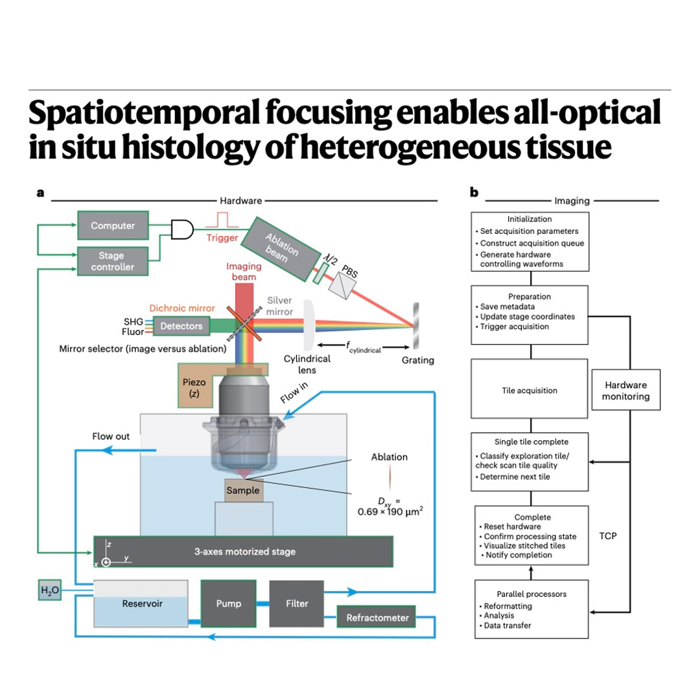Right. It's a really clever fusion of technologies. Okay, let's unpack the system itself first. What are we actually looking at? The papers describe it as having this dual identity. It's both a microscope and a precision cutting tool. That's really the heart of it. It integrates two main components very tightly. First, you have a diffraction-limited scanning multiphoton microscope. That's your imaging system. Multiphoton, okay, good for deep tissue imaging.